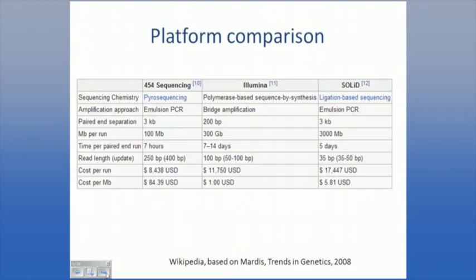So Illumina isn't the only technology to do RNA sequencing. 454 sequencing, or pyrosequencing, is also quite effective. The read lengths are longer than Illumina sequencing. They can go up to 400 base pair, but in general, the number of reads is much lower, and so the cost for generating enough data to actually do a differential gene expression experiment is quite high.